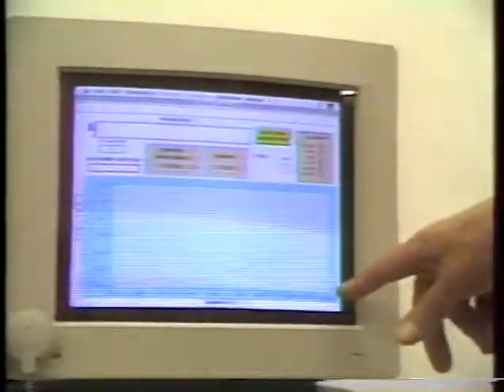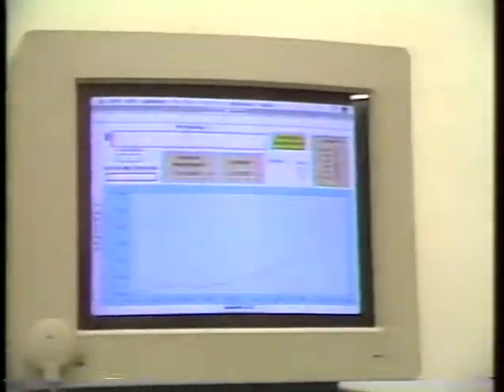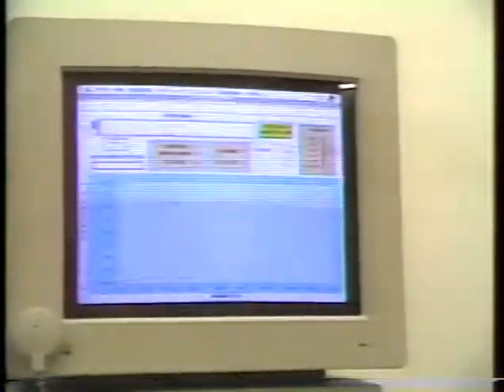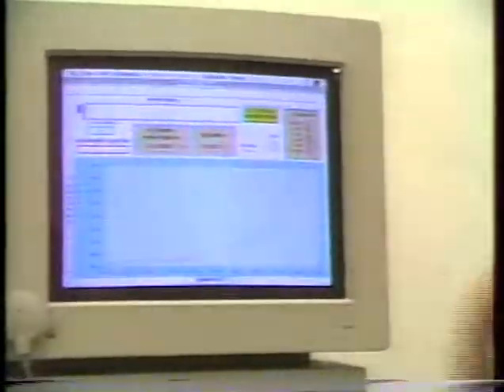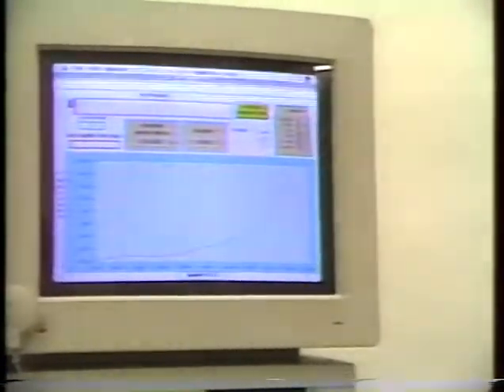Now the signal goes higher up, there is some signal there, which is 1.4 or 1.2%. And this is all baseline behavior. Now we have something going towards the 160, where this big peak in the deuterium source will occur, and we are now riding over that big peak. As you saw, we had gone up to 4 on the scale, coming down now from that big peak.